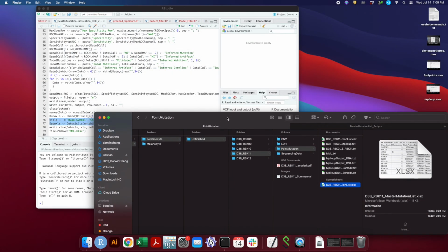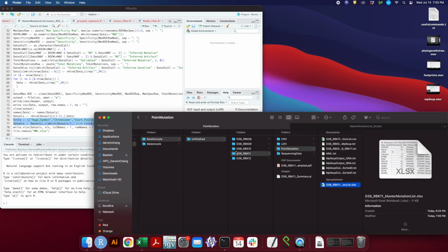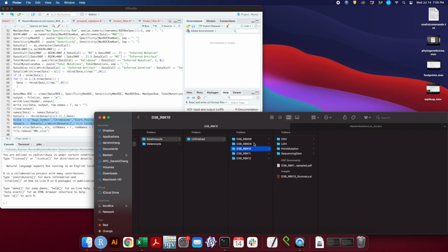Again, if you want to do this with 3 or more samples, you just need to apply this method several times over unique samples. So for example, if WB 10 was also related, you would need to compare 8 and 10, 8 and 11, and 10 and 11. And you would repeat this with additional samples if they were actually related.